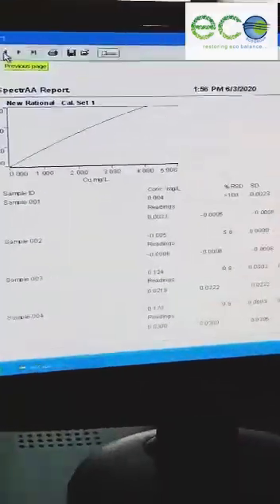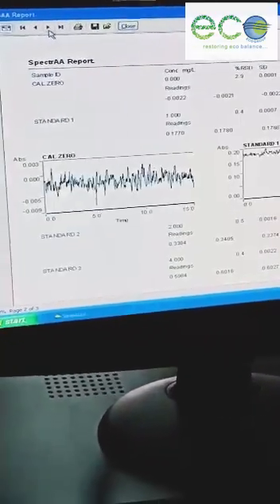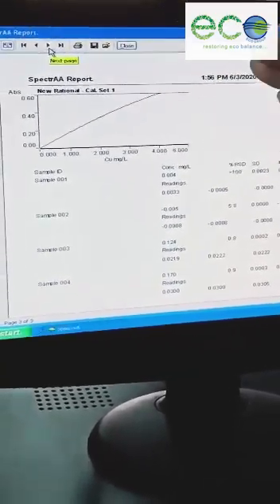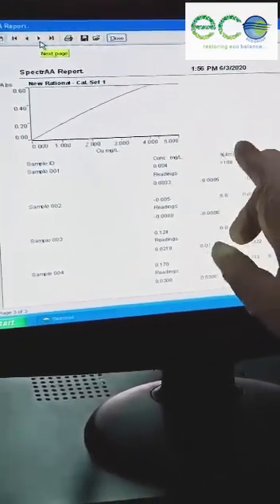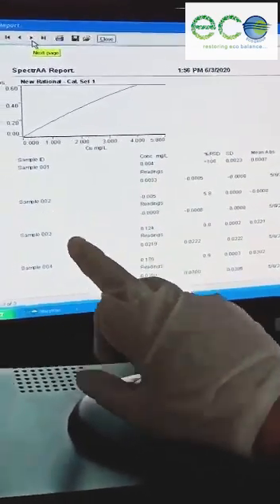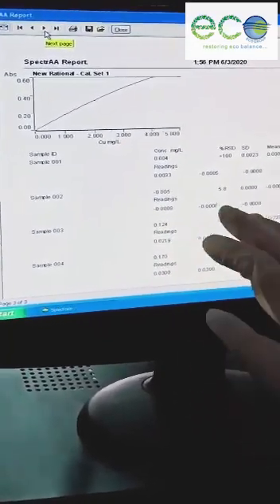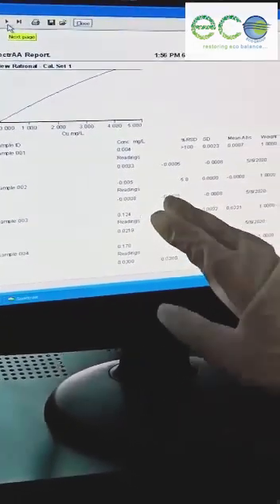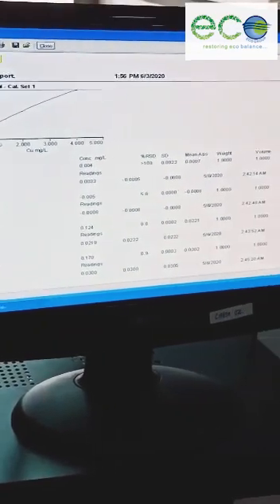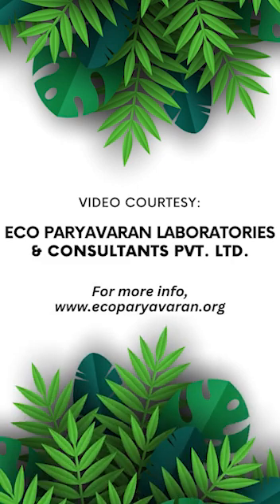This is the calibration curve, based on the standards. On the basis of this calibration curve, I will get the readings of my standards. The reading of my blank is 0.004 and the reading of my sample is 0.124. This is the concentration in mg per litre — I will get the direct reading of my element from this calibration curve.